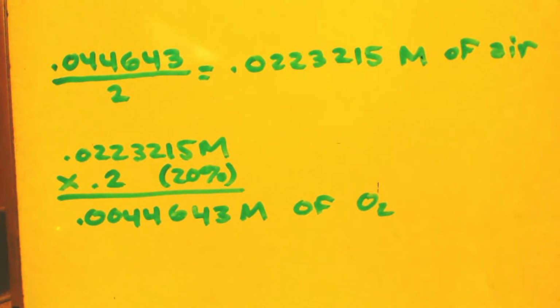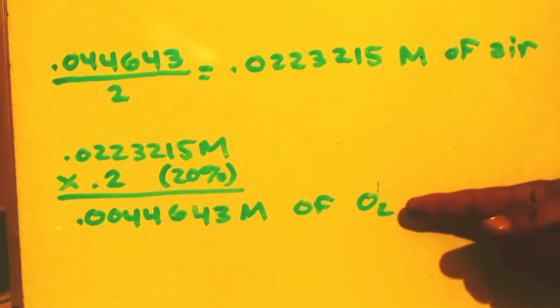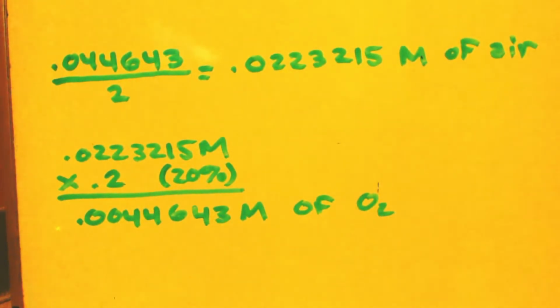So if I ever do this experiment, I would do it with the inert atmosphere and see what my yield was, and then do the same exact thing without an inert atmosphere and see what the difference is. I can't imagine this little bit of oxygen or contaminant in the vapor phase matters, and you know that the manganese acetate has to do its work inside the liquid, not inside the vapor phase. Why would you even care about this oxygen? I don't know. But let's get into how you would do it if you wanted to use the argon, okay?